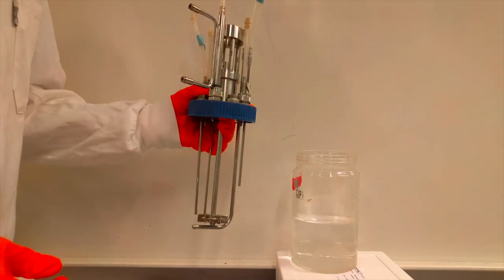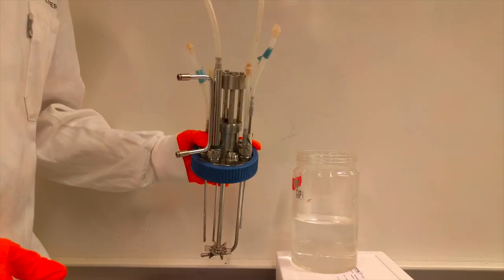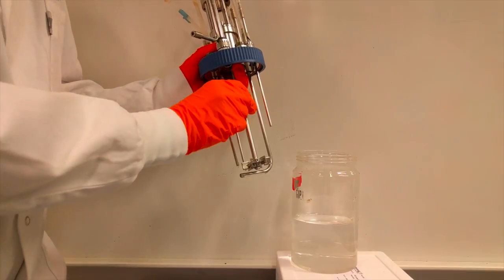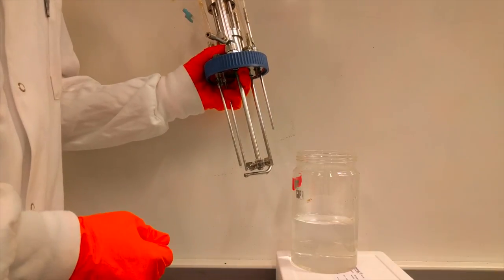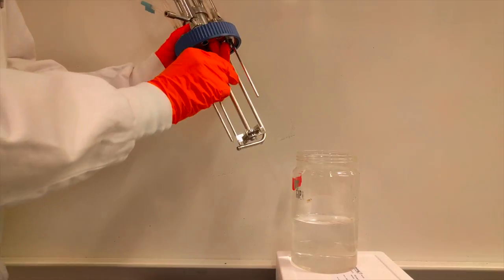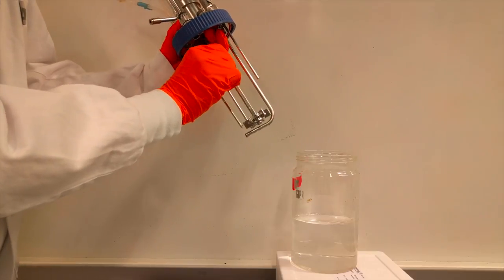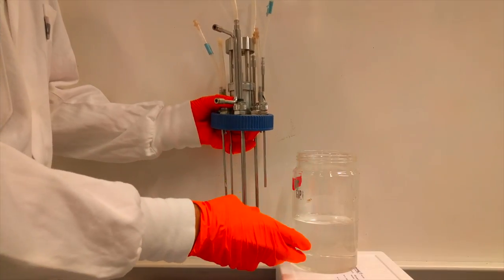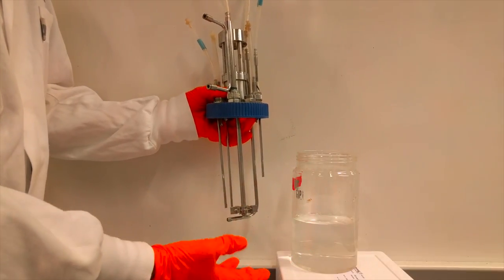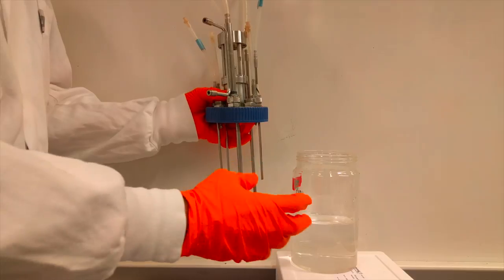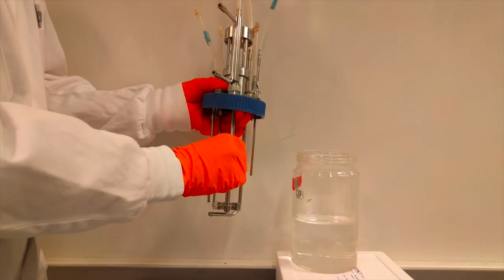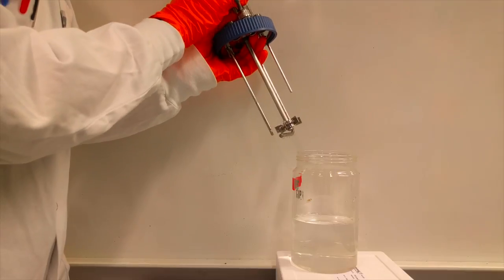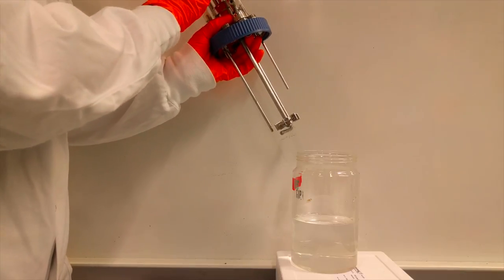The concept is that we're going to combine that vessel with this crazy looking cap unit, which is going to allow us to control a lot of variables that we can't control in a shake flask. So the first thing to look at here is stirring. Stirring is going to be accomplished by this impeller. This is going to sit below the surface of the liquid and keep the reactor stirred. It will stop the cells from settling and keep the aeration even throughout the chamber.